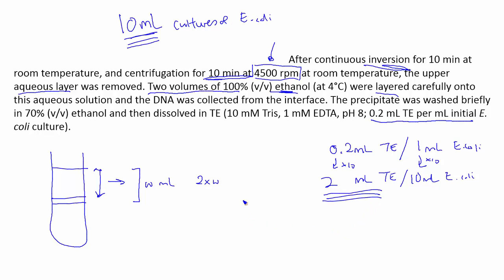Okay, so that's essentially it, converting a legend to a protocol. The main things to watch out for are the concentrations. You need to hit the original concentrations, and also anything that is dependent on different volumes you need to account for as well, for example the TE. Sometimes you don't need to change things. For example, if something is specifying 2 volumes, then the scientist knows what those 2 volumes or 1 volume means, and so there's no need to adjust that in the revised protocol.